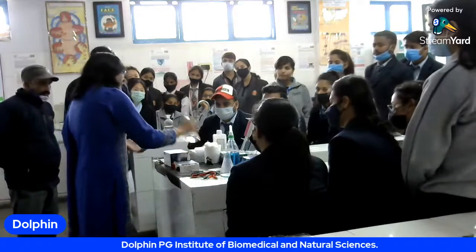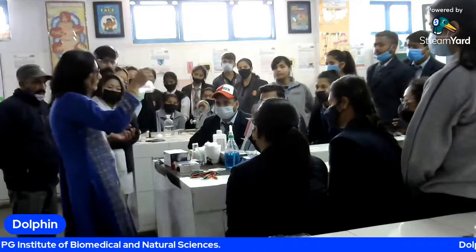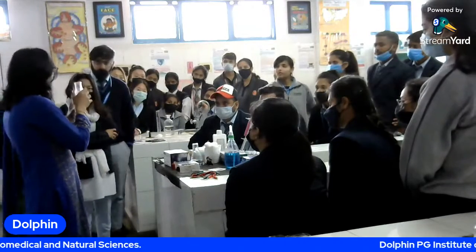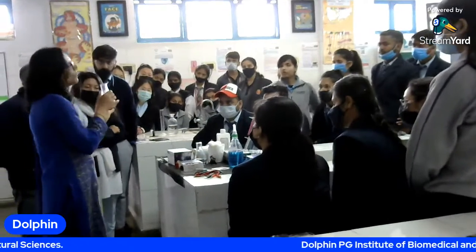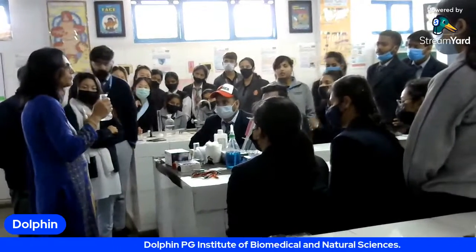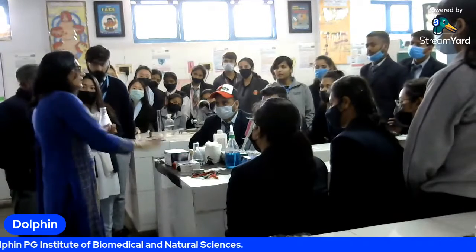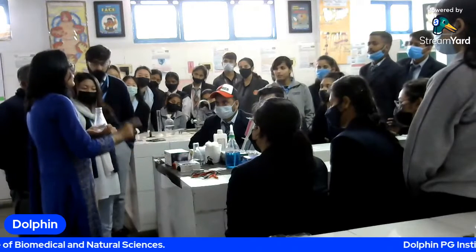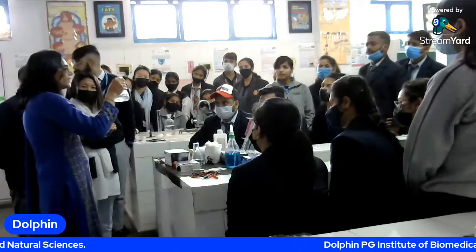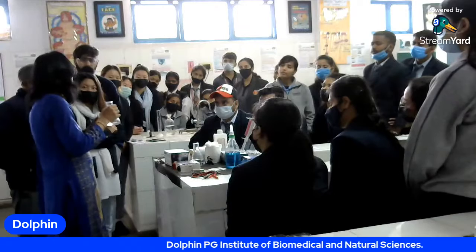The gel will be made of agarose. This is the solution of agarose. You can prepare it yourself also. How is this prepared? 1% in the buffer. The buffer is the TBE buffer. So the buffer is there in the kit. You will take the buffer, prepare it, then add the agarose and dissolve it by complete boiling.